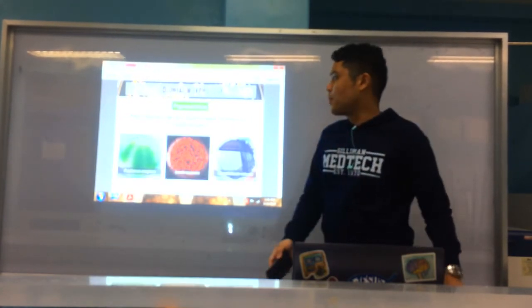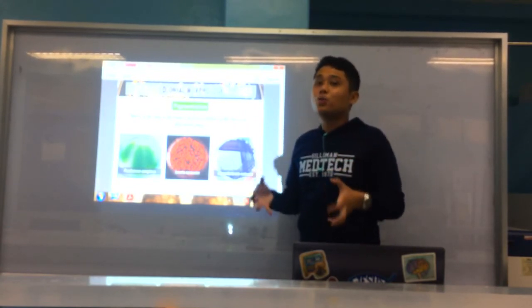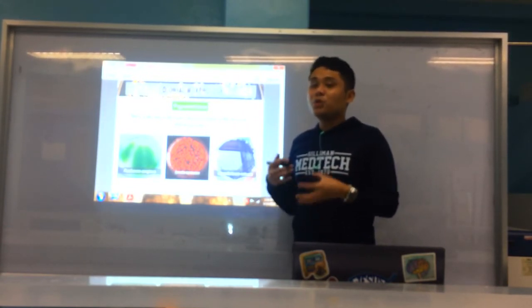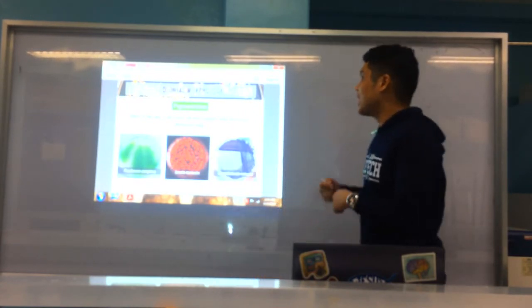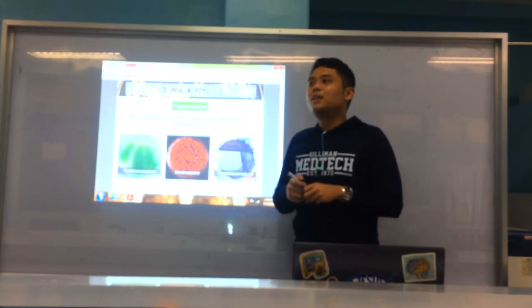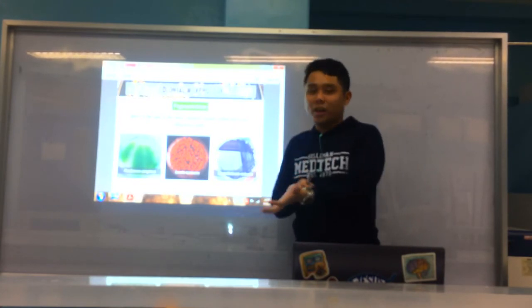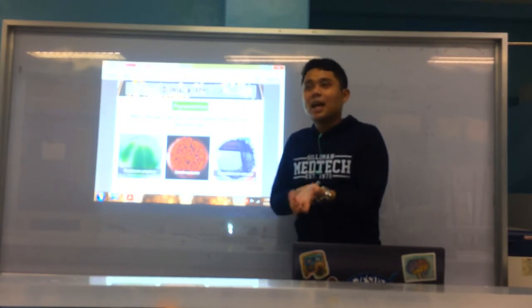Okay, so here's an example of pigmentation. Pigmentation is the innate ability of the bacteria to produce pigments. The most common example is Pseudomonas aeruginosa, a well-known pigment producer. In our lab, you will be given a known bacteria at the end of the semester.